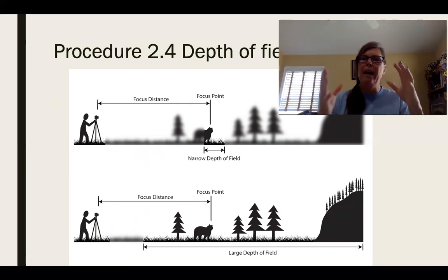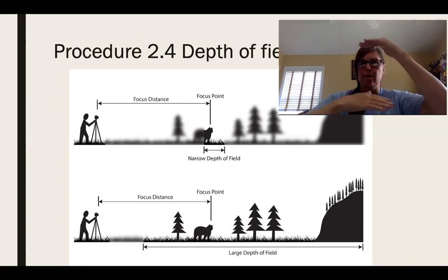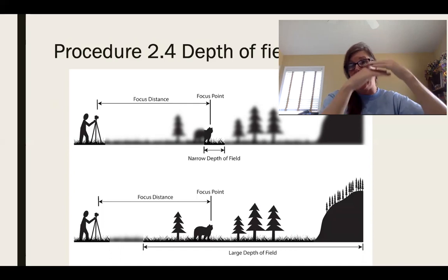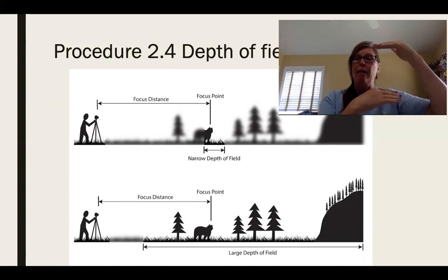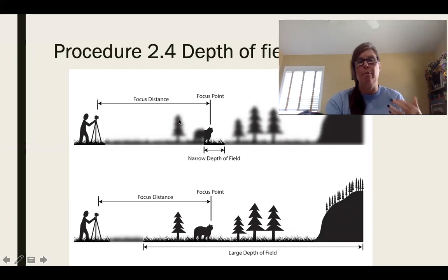Okay, so we have the same thing. As you have that diameter, the amount of area you see at one point in time, there's also a depth component. So the same thing happens. What we're saying is how much of that depth, so your slide doesn't change in depth, it's just how much of the depth is in focus. So when you have your lower magnifications, you can see more in focus at one time than when you up your magnification. So again, the depth of field gets reduced. So it's kind of like, here I have a picture. Maybe you've seen this with taking pictures.